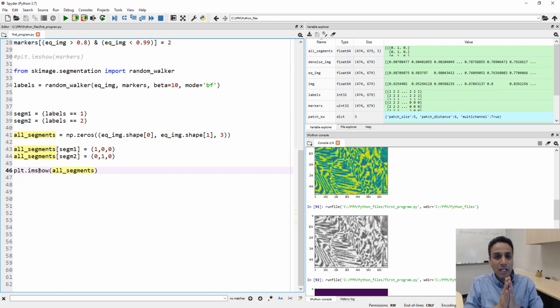Okay, so this is how you perform your image segmentation. This is no different than how you would do it on proprietary software or software like ImageJ, where you do some operation, and then you equalize your image, and then you do something else. But here everything is automated. Now I can actually go ahead and use this on many images that look very similar.